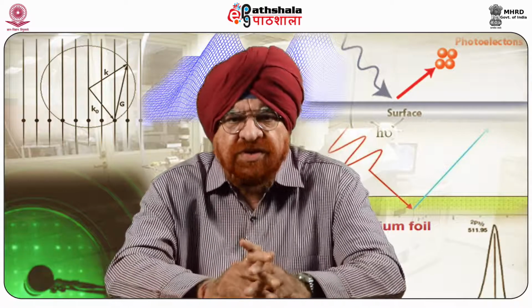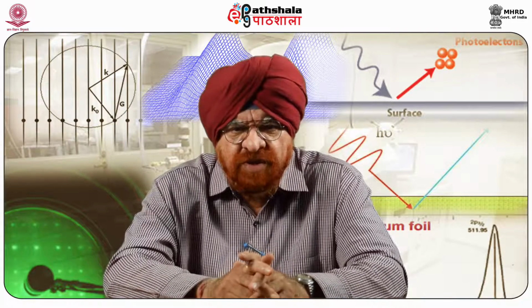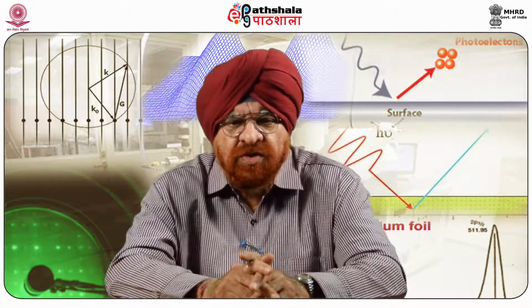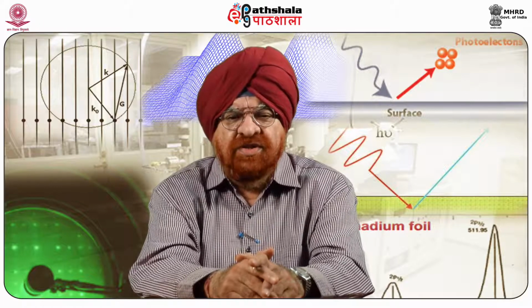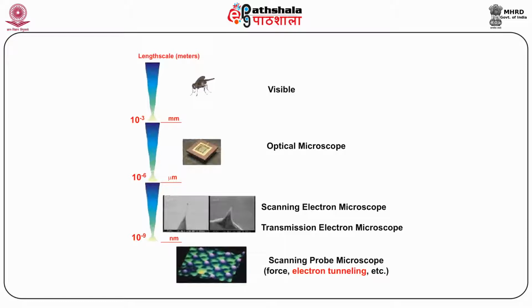So the question which arises is, why study SPM? The SPM technique images the surface structure with atomic height resolution without the necessity of damaging the sample. The results are shown as a kind of three-dimensional image. SPM operates without vacuum, and in contrast to electron and optical microscopes, it can measure different other physical properties. The scanning probe microscope can scan samples from a very small scale to about the millimeter scale.